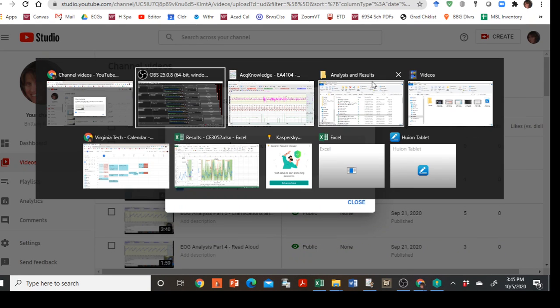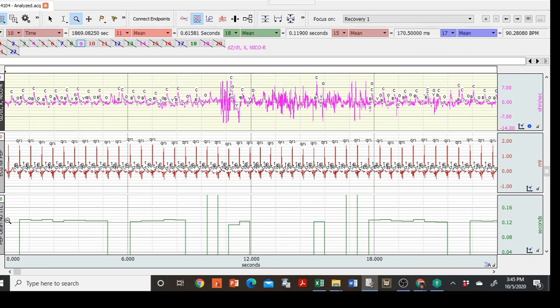Okay, once you have found your PEP channel that you're going to be cleaning, the next thing you're going to want to do is make a duplication of this channel. You don't want to be doing too many modifications to the same channel. It's helpful to, in a way, have a history in all of your channels as to what you did to create each channel.